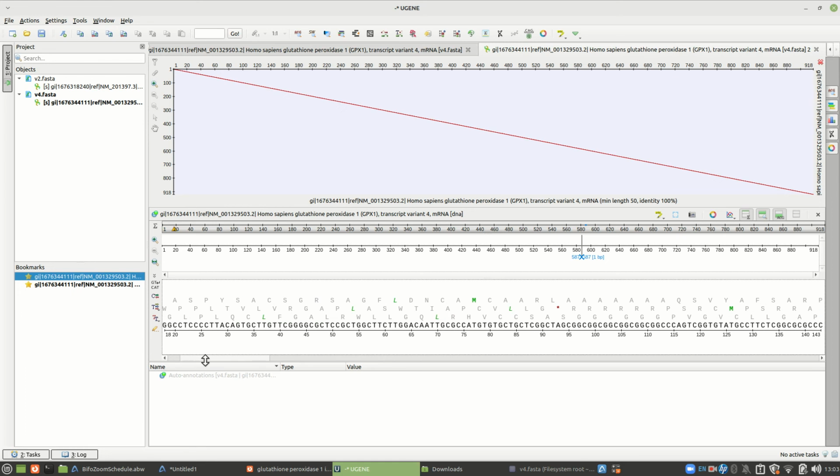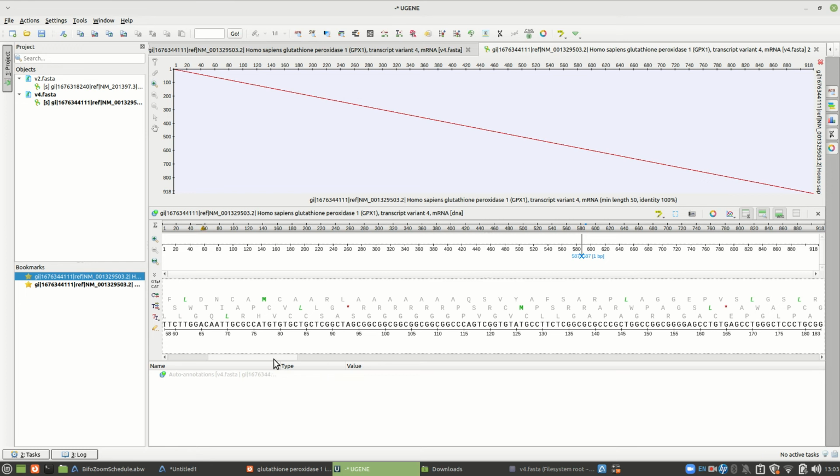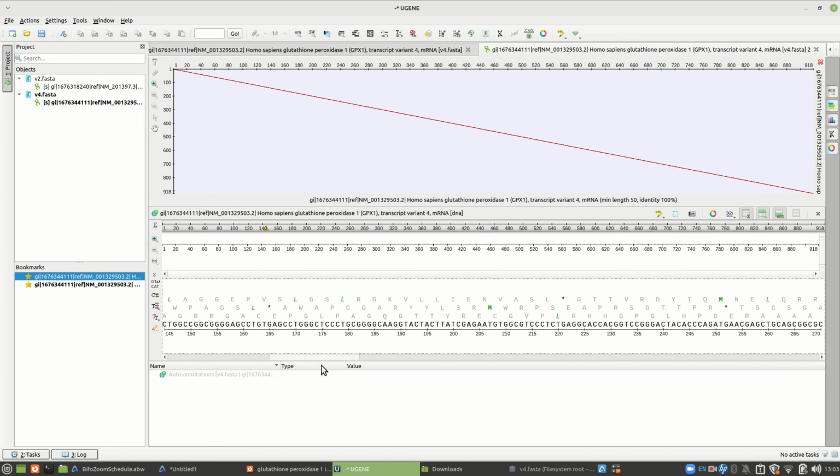So according to me, if I'm turning this in, I'm going to analyze this, and I'm looking at this up here, and this here, the first stop codon is before the splice site, so we didn't change reading frames. I didn't have to change from here to here to here when I spliced, because you can splice in the middle of a codon. There's no reason you can't. Then I would just say that that's the stop codon right there, and it would be a TGA, and it's going to be actually in the top one.